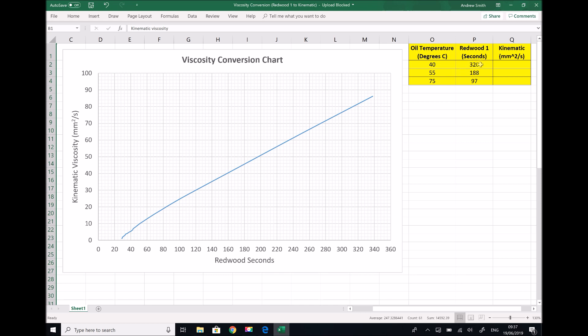At 40 degrees C our test took 5 minutes and 20 seconds — that is, it took 5 minutes and 20 seconds to collect 50 millilitres of oil — which converts to 320 seconds. At 55 degrees C the test took 3 minutes and 8 seconds, which is the same as 188 seconds. And the third test at 75 degrees C took 1 minute and 37 seconds, which is the same as 97 seconds.